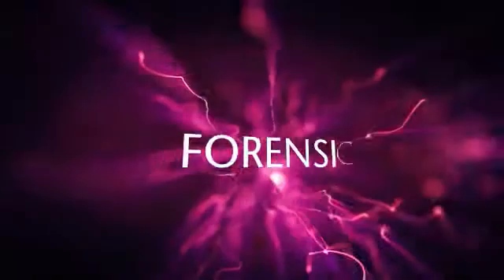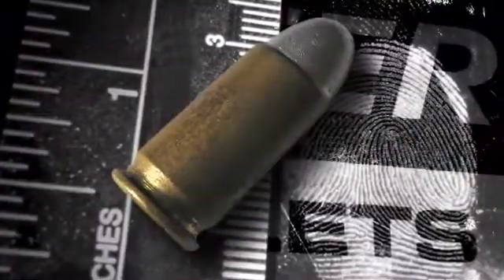FEI's Phenom is a revolutionary desktop electron microscope for use in a variety of applications.